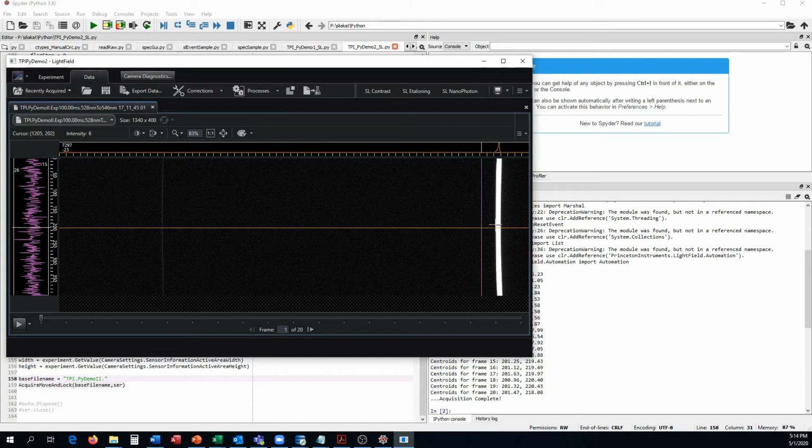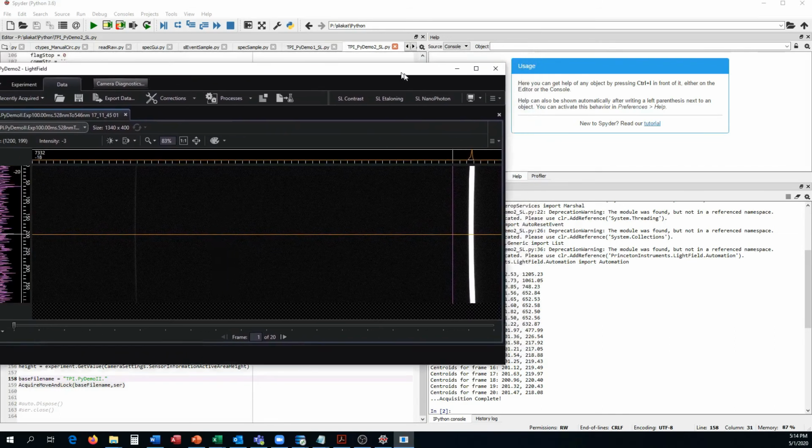And that's accurate. I mean, this is your main peak. You have a slight shade of gray here that's pulling it back a bit, but for the most part, if you're taking this whole image into consideration, that's where your centroid is going to be. If you're taking a local region, then your centroid will be more around here. But again, we're taking the whole image. So let's move along.